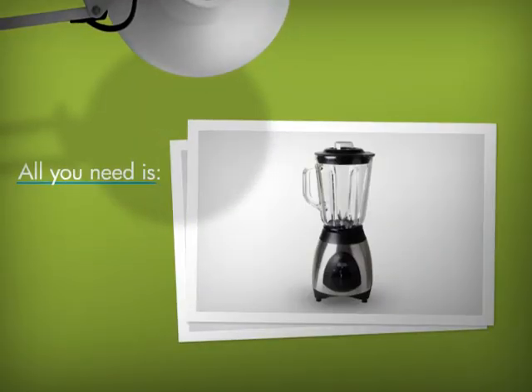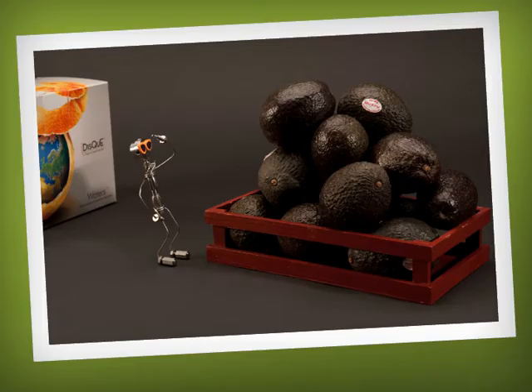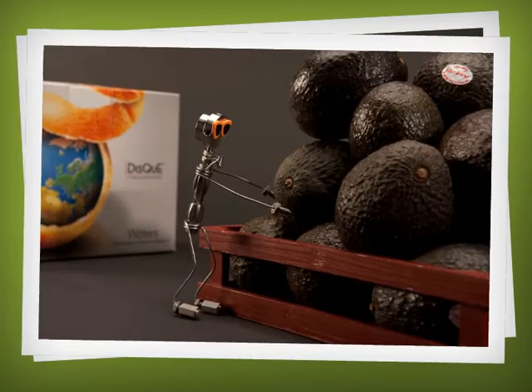All you need is a centrifuge, blender, pipettes, and Waters' conveniently packaged DisQuE dispersive sample preparation kit — oh, and your sample of course.